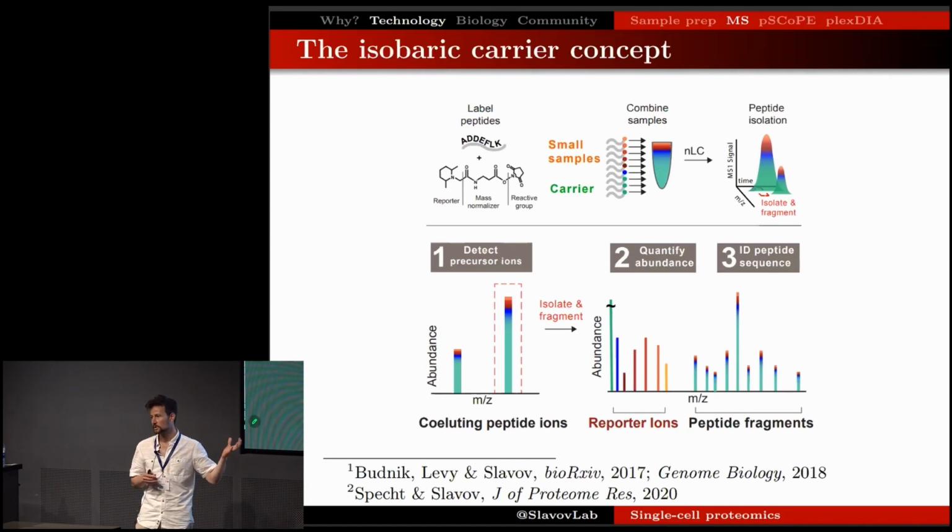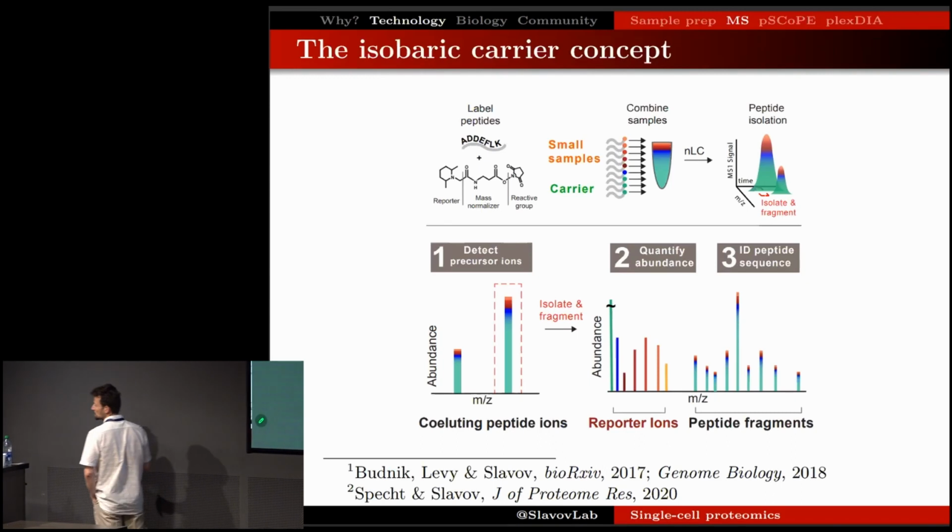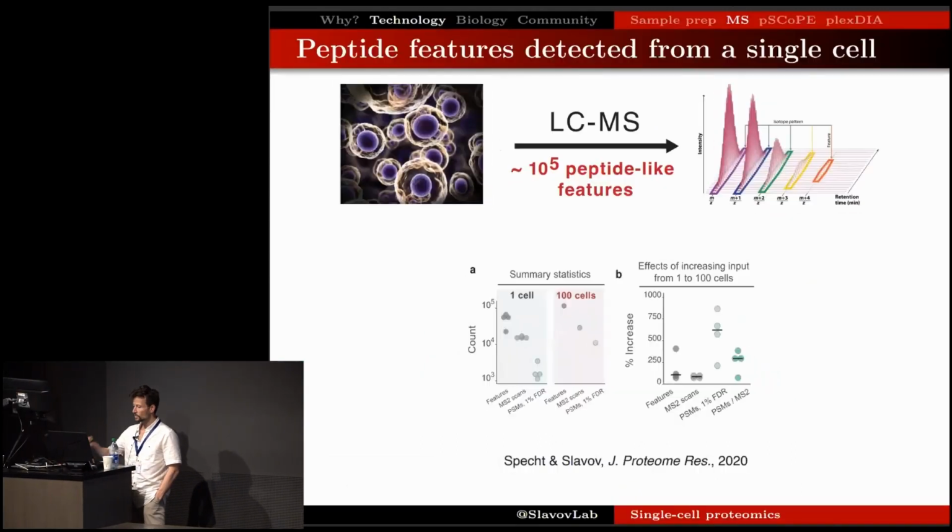We did not have access to the latest technology. We used relatively old instruments. So we did this in 2016, using instruments from 2010. But it actually helped begin to change the thinking about what's feasible, because it challenged this notion that mass spectrometry is not sensitive enough. Of course, it wasn't easy to challenge the notion. There was a lot of skepticism. Does this really work?